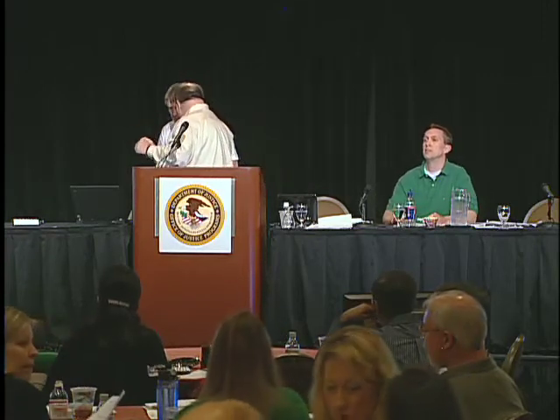Todd, can I ask you a question? Sorry, you thought you were done. On this same profile, and I don't use this particular multiplex, there's a locus that is only registering a 15 allele, but there are 2 alleles that must have been under the allelic threshold. Can anybody tell me what locus that is, at 119?